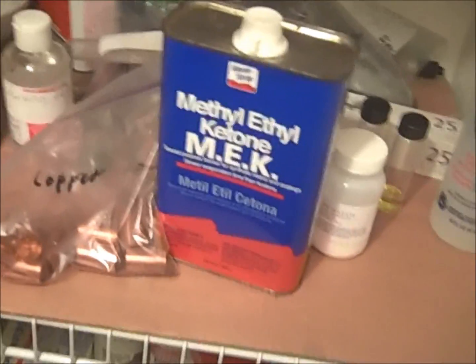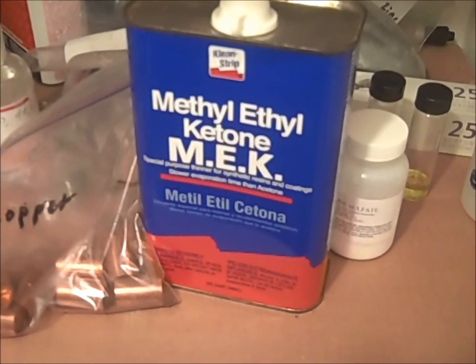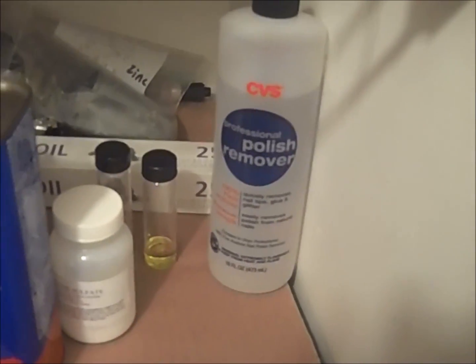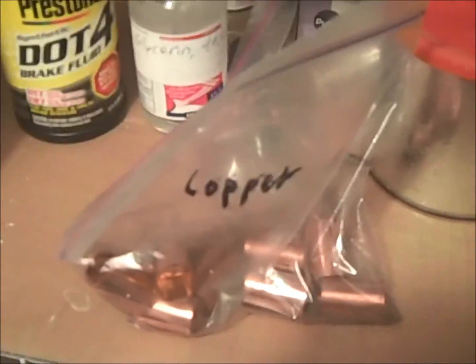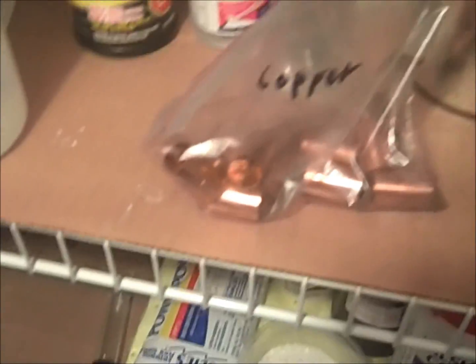We continue with flammable materials and metals. This is methyl ethyl ketone, which is a ketone sold at hardware stores in the paint section. This is acetone, which can be purchased from hardware stores, although it is cheaper from pharmacies as nail polish remover. This is hydrazine sulfate, which I purchased online for an experiment involving luminol. This is metallic copper, which can be purchased from various sources — I got mine as pipe fittings from Home Depot. This is lithium, which I got from an Energizer Ultimate Lithium AA battery, and I'm storing under mineral oil in a vial. This is sulfur, which is purchased from gardening stores.